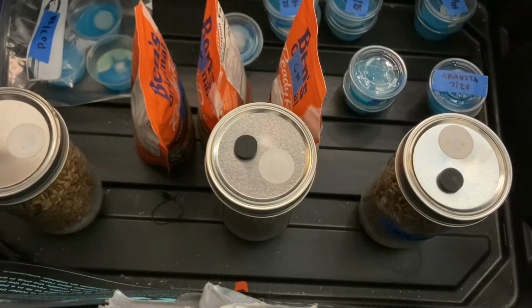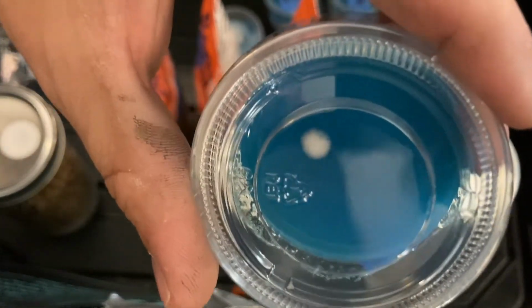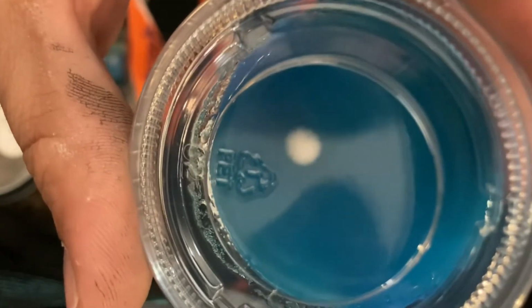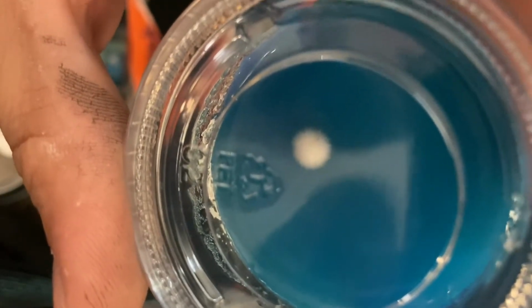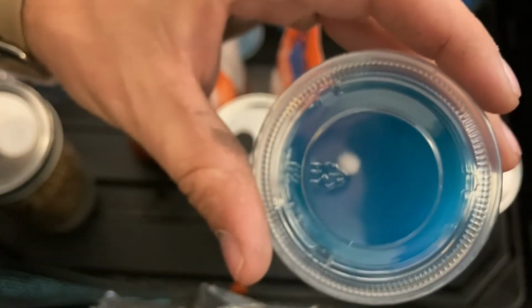So I'll just pull off the caps, stick them on the bottom. This one also has some really healthy rhizomorphic mycelium growing in there. Try to focus on it a little better for you. And that looks good. It's just a lot slower growing, so that's why I'm not going to use this one. Then we have the three that were inside of the bag that we did. So I'll show you how those are doing as well.